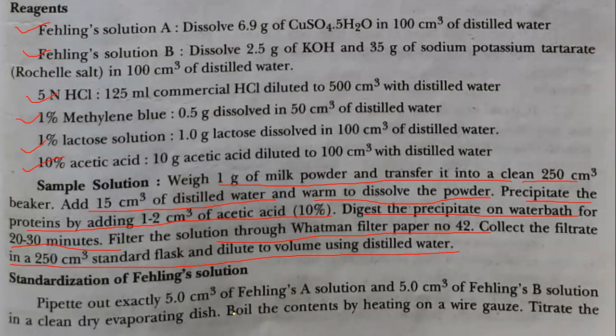You just have to remember the solutions, and there is no need to remember how they are prepared. That is available in the literature, but you must know we are using Fehling's solution A, B, 5 normal HCl, 1% methylene blue, 1% lactose solution, and 10% acetic acid solution.